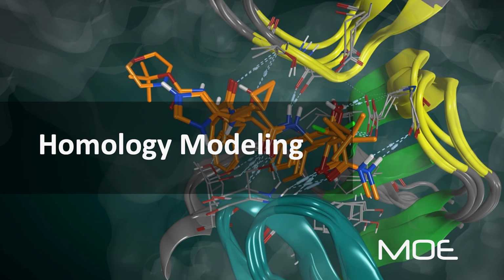Today I'd like to introduce homology modeling in MOE. In this demo we're going to start with the sequence before building a structural model, and then finally we'll analyse the quality of that model. This is a typical workflow for cases where no crystal structure exists.